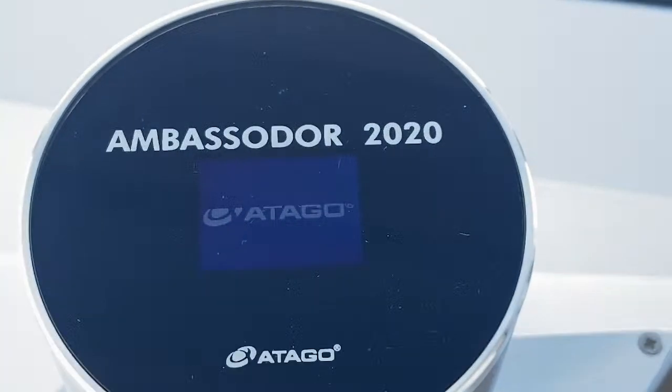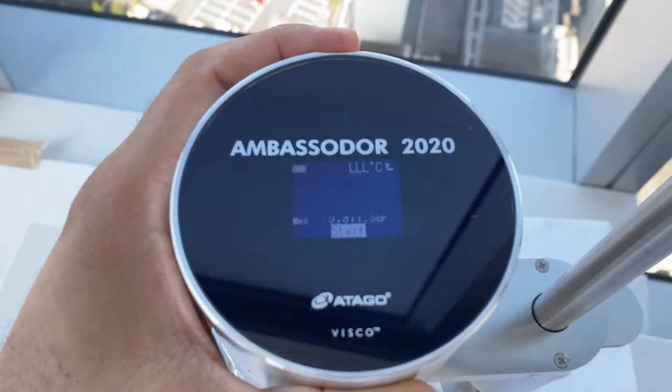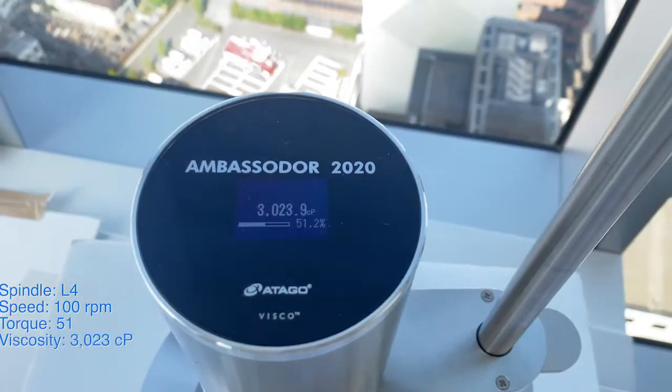And then the settings here is 100 RPM, and we're using the L4 spindle. L4 spindle, 100 RPM is giving us torque of about 51%, and the viscosity is 3,023 cP.